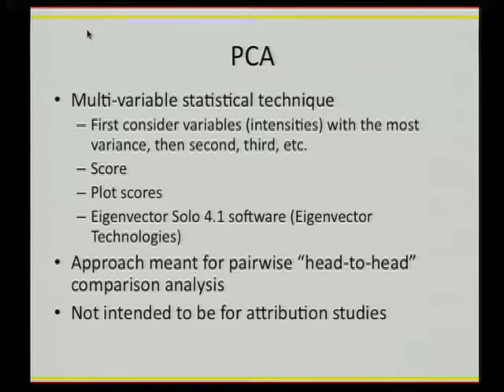This approach is actually meant for a head-to-head or pairwise comparison, and it's not meant for attribution studies. So we're not looking to fill out a database. We're looking to compare two samples to one another.